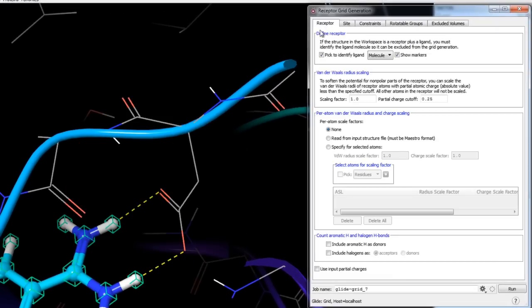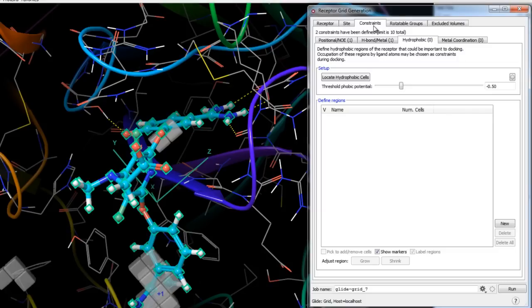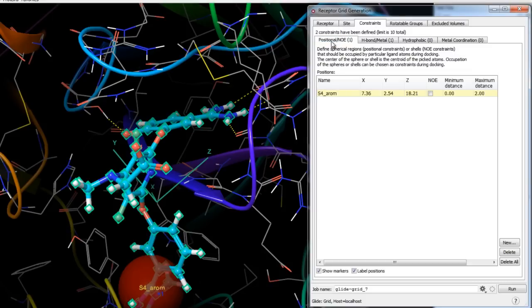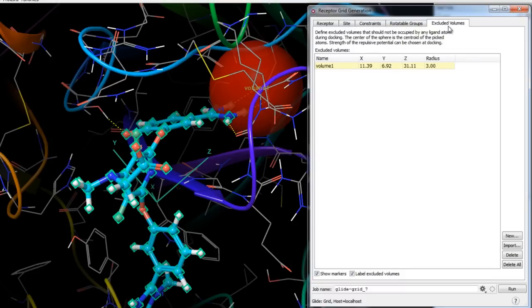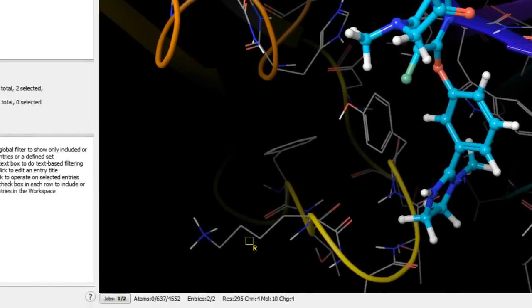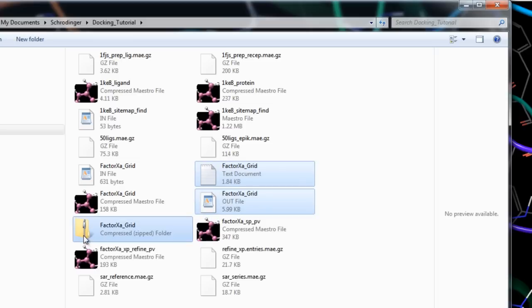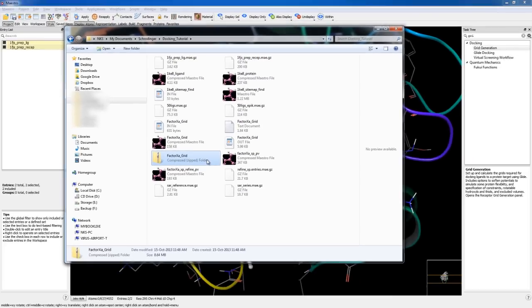Now that the co-crystallized ligand has been selected for exclusion, the active site defined, and the constraints set up — one positional constraint, one hydrogen bond constraint, and an excluded volume — we can start the grid generation job. We'll rename the job to factor10a_grid and click Run. We can monitor the job in the Monitor panel; it should take only a couple of minutes. When finished, the directory will contain a log file, an output summary file, and the all-important zip grid file containing all necessary grid files for the ligand docking stage.